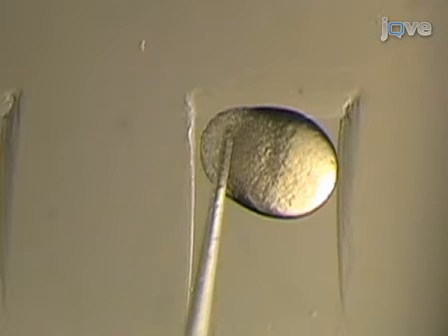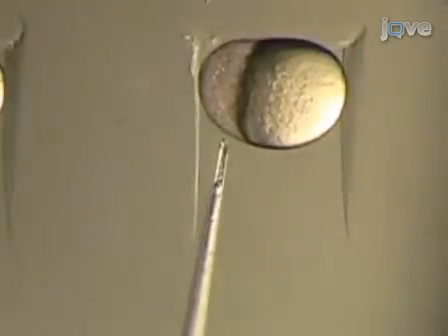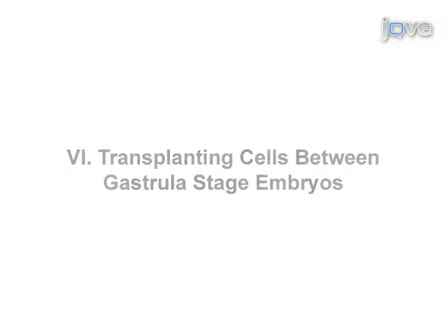The key for primordial germ cell transplants, which is quite the opposite of any other kind of transplant, is that it matters where the donor cells come from.